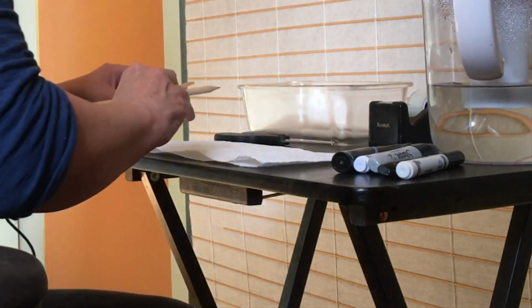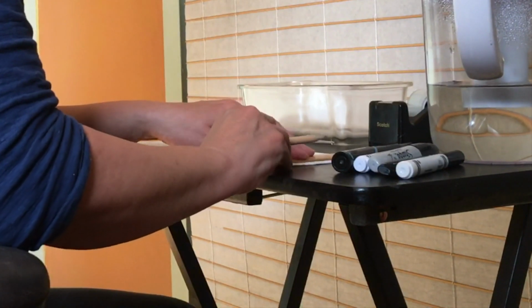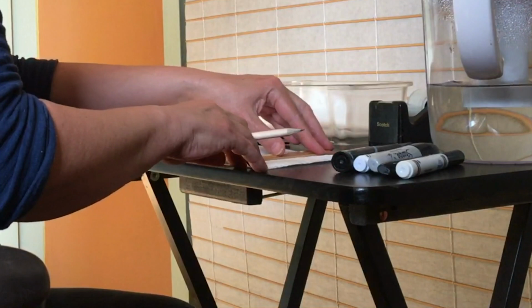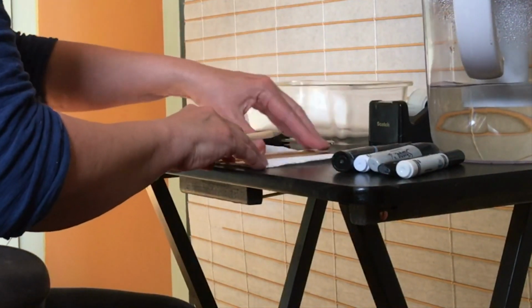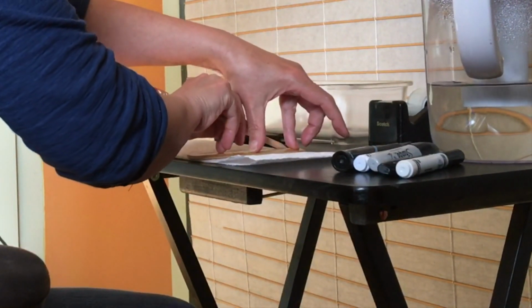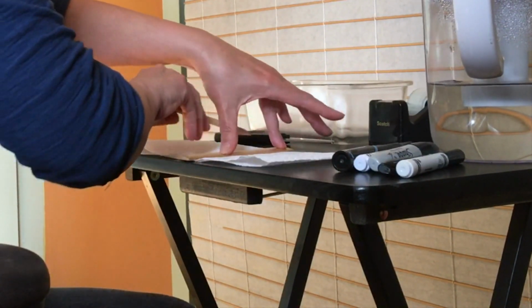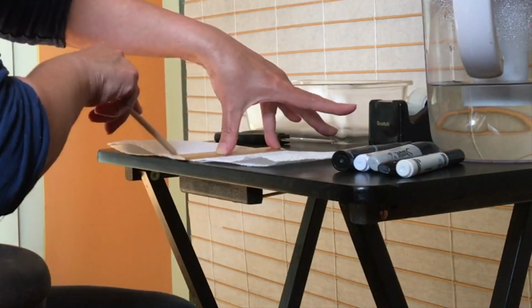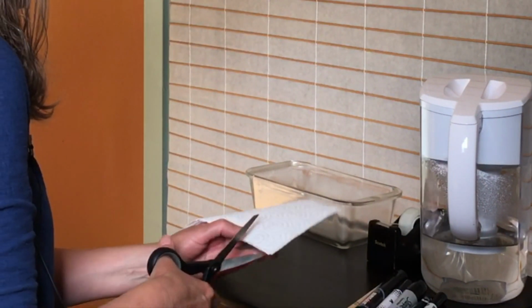So first we're going to cut our paper towel into strips. I'm going to use a pencil. They don't have to be exactly the same, but they should be pretty close. So I want 5 strips, and then plus I'll have a strip for our sample, which would be what we took from the scene of the crime. And then next I'm just going to cut the strips.